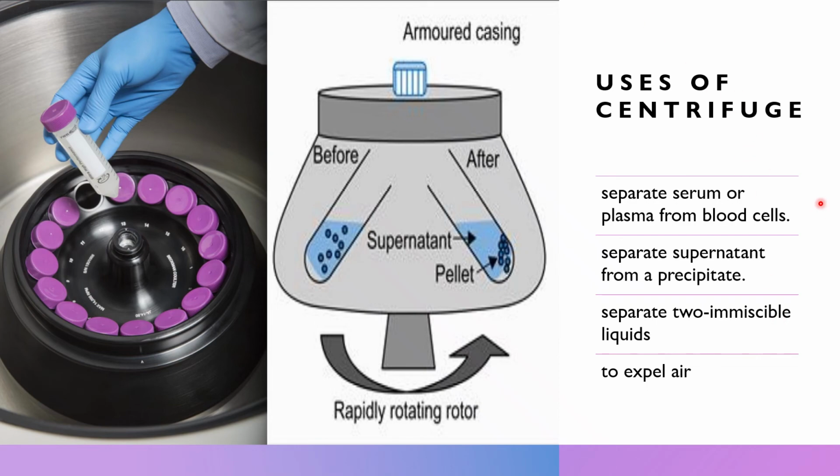The speed of a centrifuge is easily checked using a what again? You check the speed using a tachometer, or a strobe light. So you use a strobe light or tachometer in order to check the speed of a centrifuge.